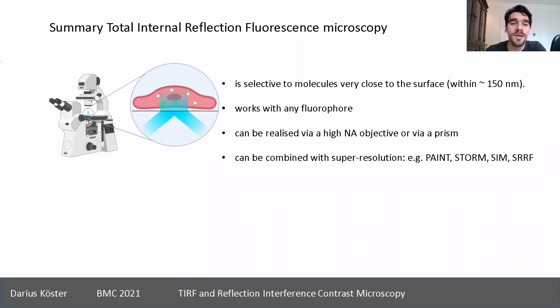So if I go in like this, no, wait, if I go in like, oh, I cannot draw, sorry. Let me erase that. My hand is not steady enough. So if I go with the lower incidence, then what can happen is that your light gets just refracted, but it's not total reflection yet.